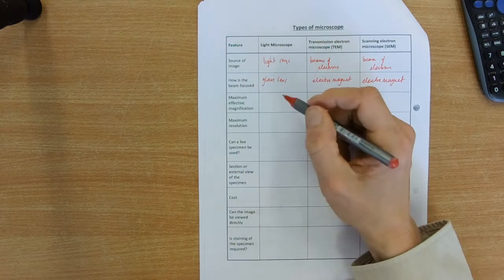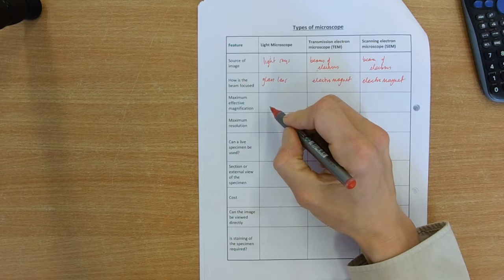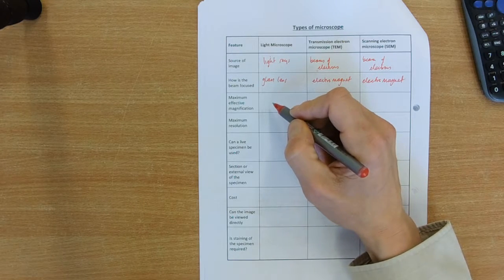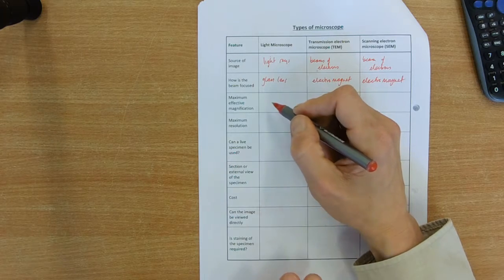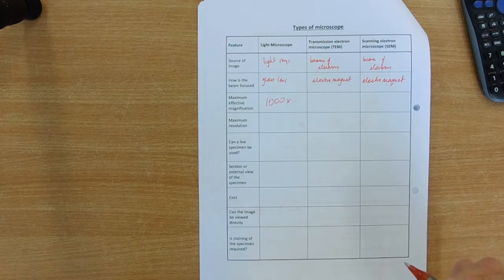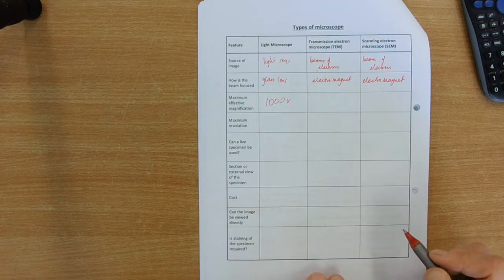Magnification. So the ones that we've got here at college, the ones that you use go up to 400. Then we can put an extra lens in, an oil immersion lens that takes it to 1000. So 1000 times. Then it becomes very difficult to see things. We lose the resolution.